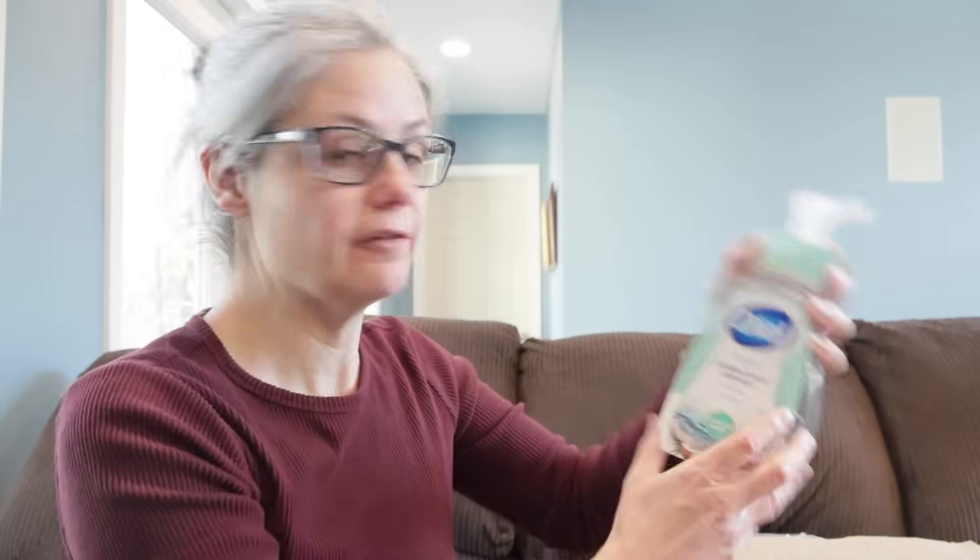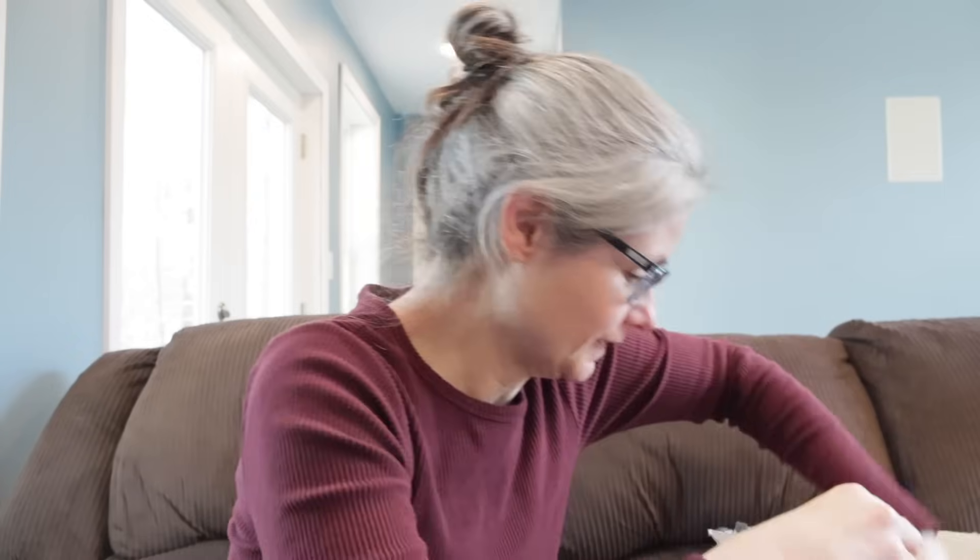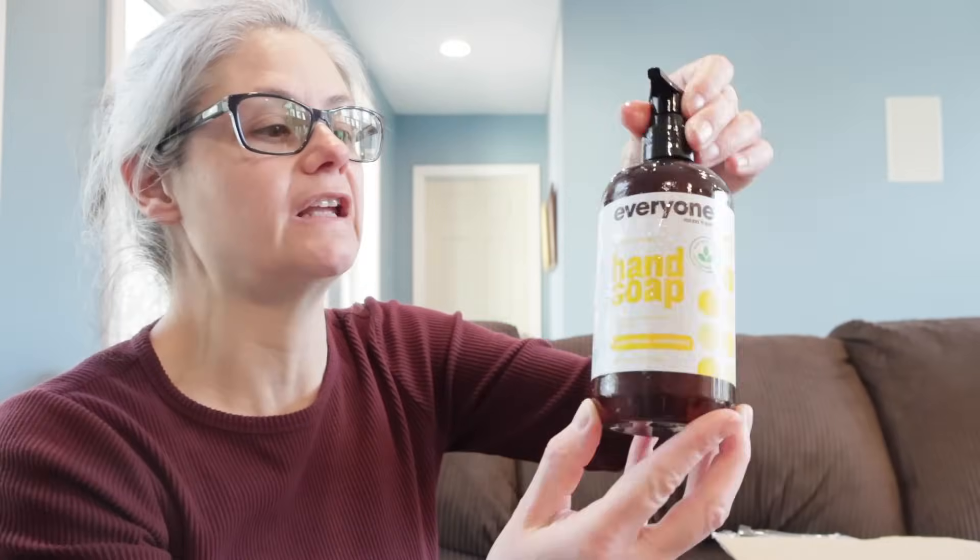So let's see what hand soaps Roger mailed me. Oh, these look good. Let's look at them one by one. Okay, so we have the Dial Foaming Antibacterial Defense, a bar of Ivory Soap, Dr. Bronner's All-in-One Hemp Almond Pure Castile Bar Soap. Oh, one leaked a little bit — that's okay, there's plenty still in here. This one is called Everyone for Every Body Gentle Nourishing Hand Soap, and Mrs. Meyer's Clean Day.